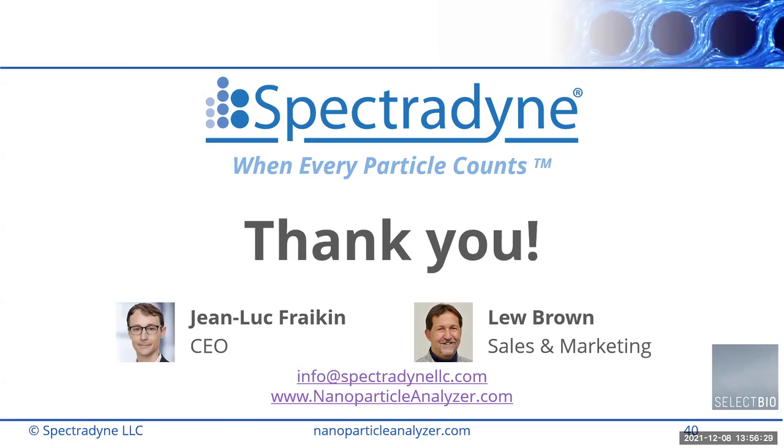So did I hear you right that you're saying, does the NCS1 control for the flow rate through the pore? It accounts for the flow rate through the pore. It's a fixed pressure system. But as the transit time slows down, you can double the viscosity of the sample and it halves the flow rate through the constriction. So it accounts for differences in flow rates that way.